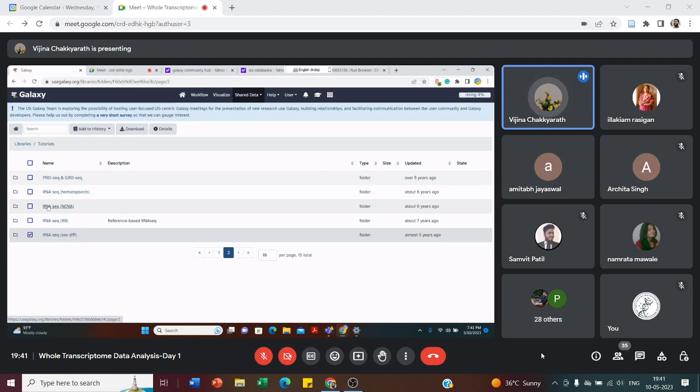If you want to take your own personal data, you can do that. When I took the first one, it's showing imported. Yeah, then you take that one. So others also try a different data set or the same data set.